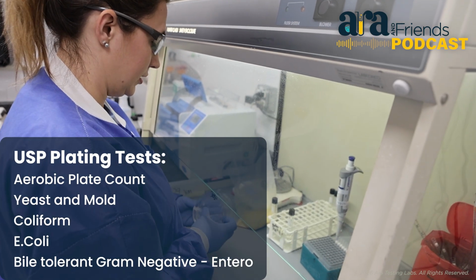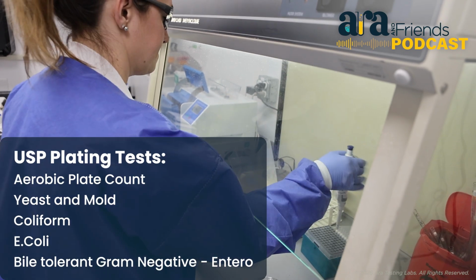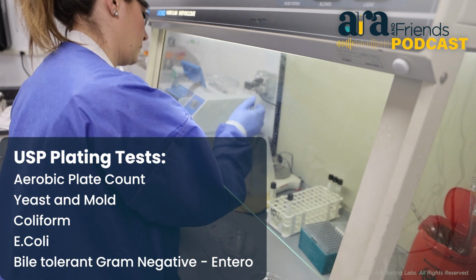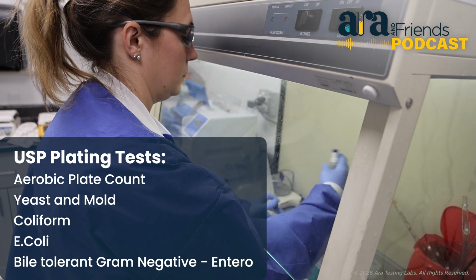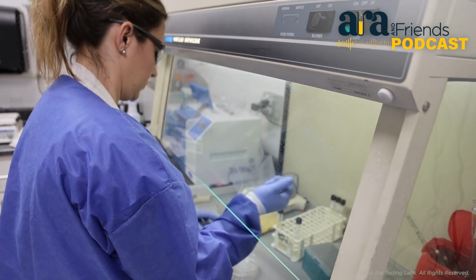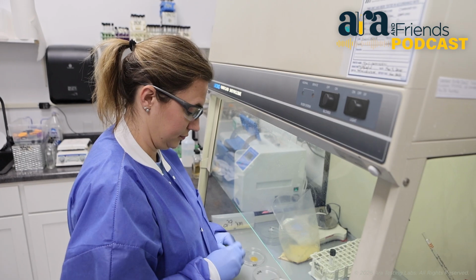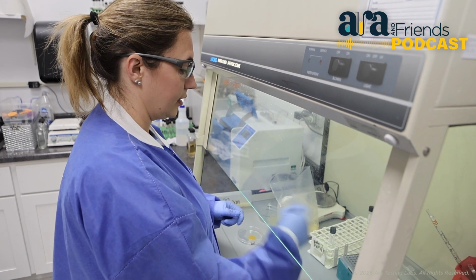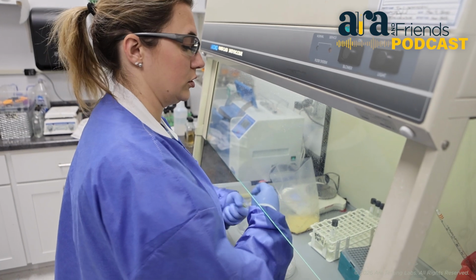They are labeled with the sample number and dilution on them. My second dilution, just inverting, make sure it's mixed to make my third dilution.